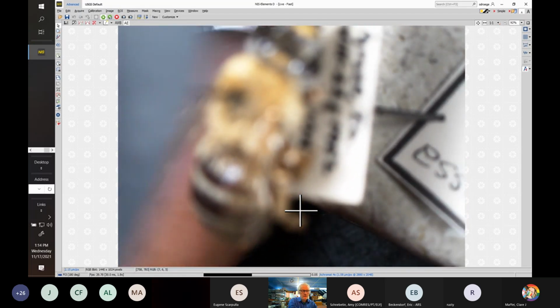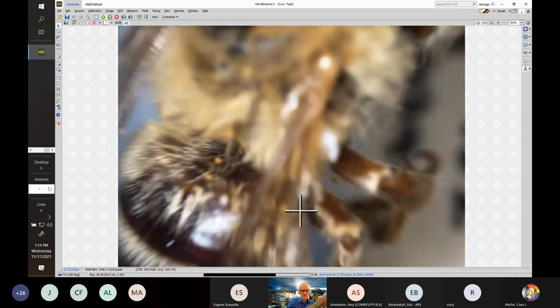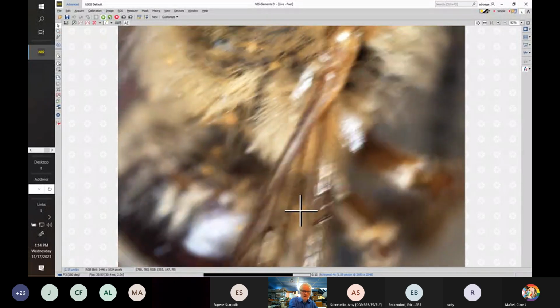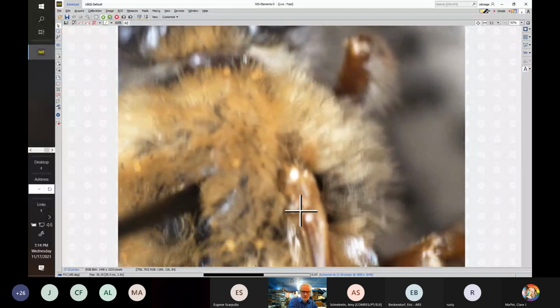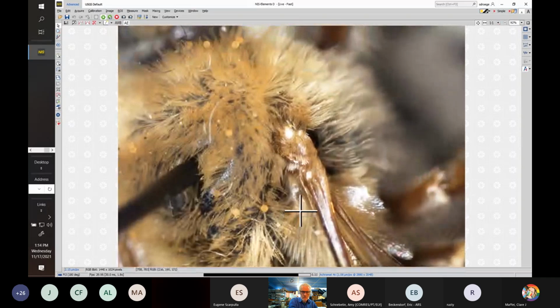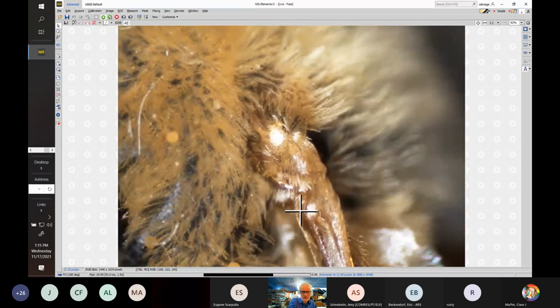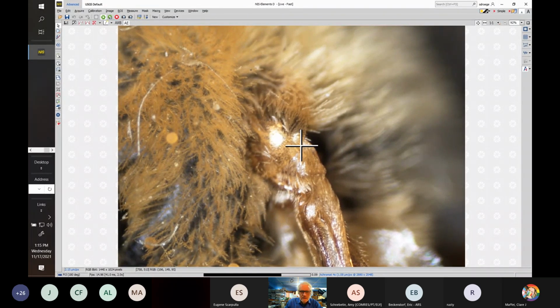Been in the garden working a lot, so ignore my fingers. And we look at, or hopefully we can look at, the tegula here. It should be basically oval. If not, maybe my bean comment was of some relevance, but I believe it's very clear. So, I mean, clear as in transparent. There's the tegula right there.